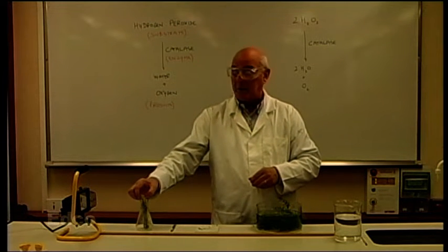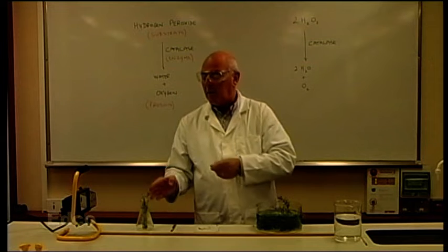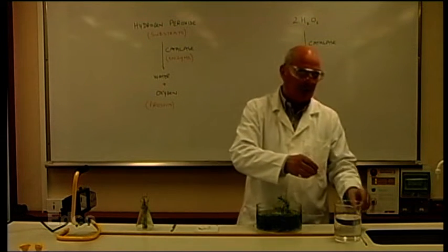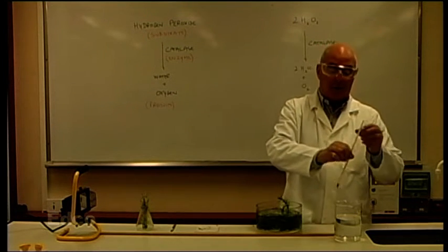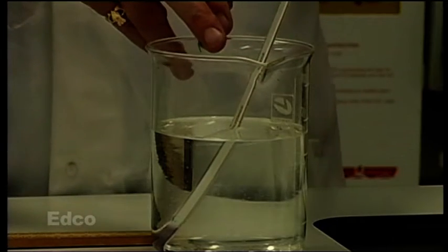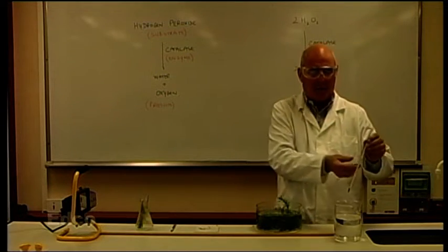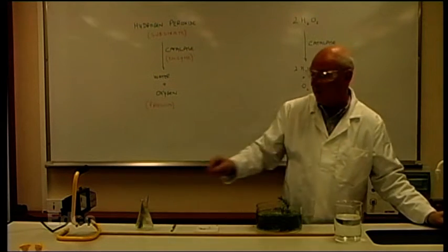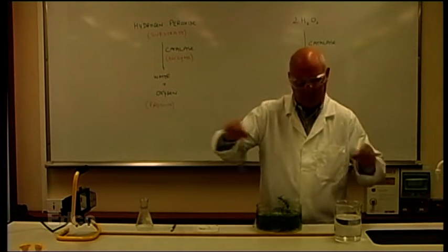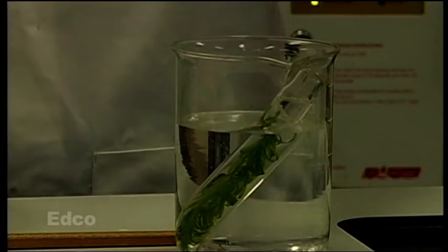To make sure that the experiment is carried out at a constant temperature, we place the Elodea in a water bath. And the ideal temperature for Elodea would be 25 degrees. So using a thermometer, we set up the water bath at 25 degrees centigrade. We then place the Elodea in the water bath, and we switch on the light.